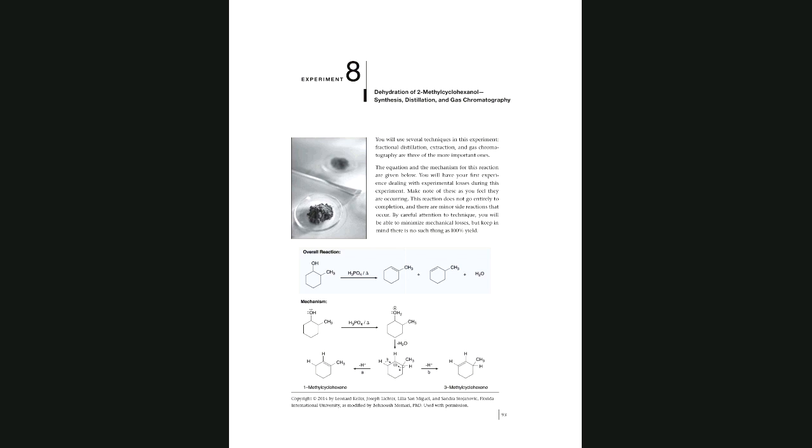So we will prepare alkene. How do we prove that we have alkene? Can anyone answer that question? How can we prove that we do have alkene as the product? You could do Baeyer's test. Okay, for unsaturation, you can add Br2, like what you learned in lecture, and the color is going to change. Or you could add permanganate. The color of the permanganate is going to change from a purple color to a dark brown precipitate. That means it has reacted with the carbon-carbon double bond.